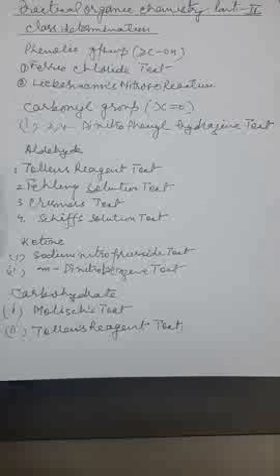Tests for aldehydes. The first test is Tollens reagent test. To the reagent, add 2-3 drops of the substance and heat on a water bath for about 5 to 10 minutes. A grayish black precipitate or silver mirror is obtained. Reducing sugars also give this test.